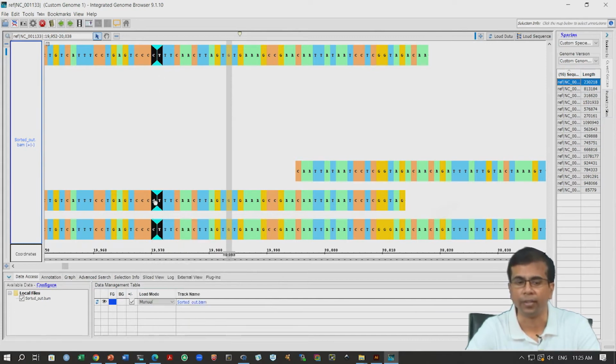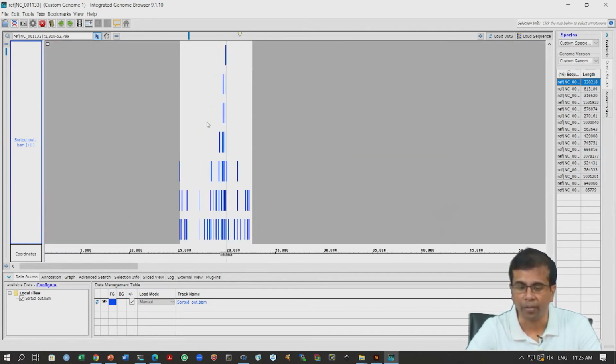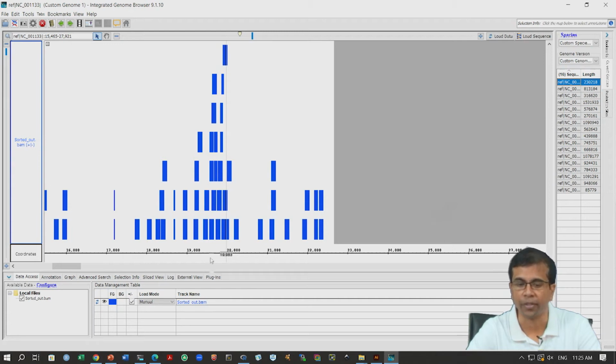This is how we can verify if this is correct and if the alignment is also okay, etc. You can also load the reference sequence, and you can also load the VCF file here. We will not try to do that, it will take a lot of time because the VCF file can be big. One thing I will show you: we can zoom out a bit and see the read mapping for these positions, and we can actually load the full mapping that I have done, and I can show you how this full mapping would look. It will look much more complete along these positions.